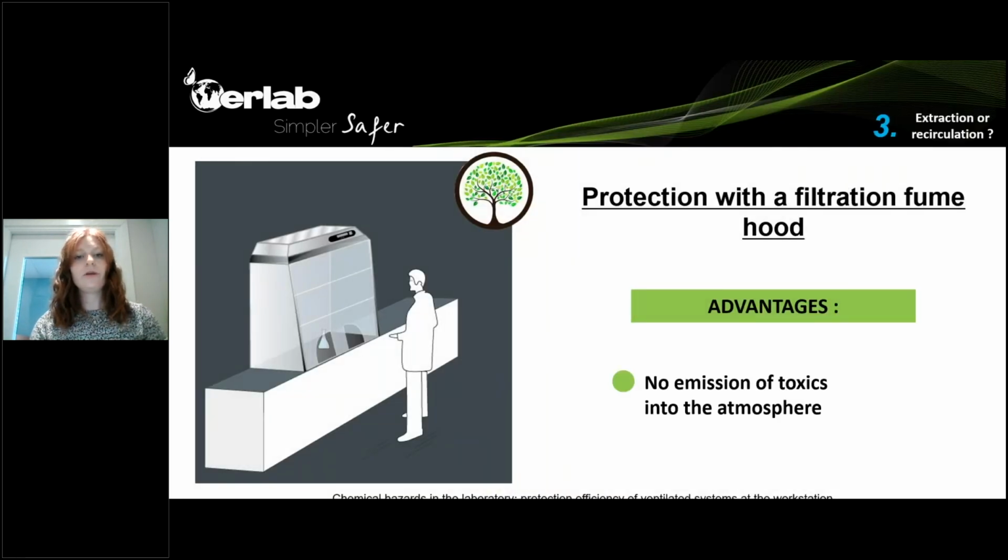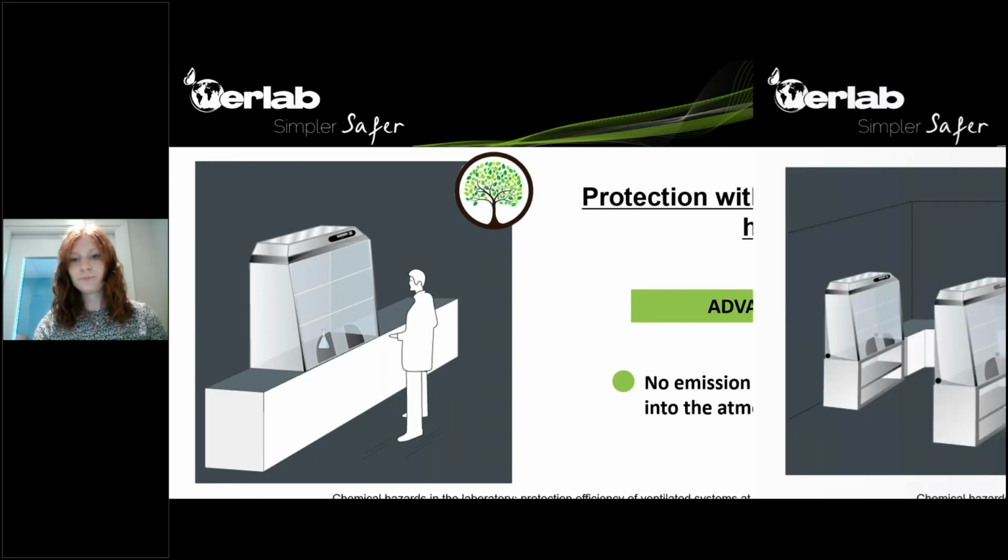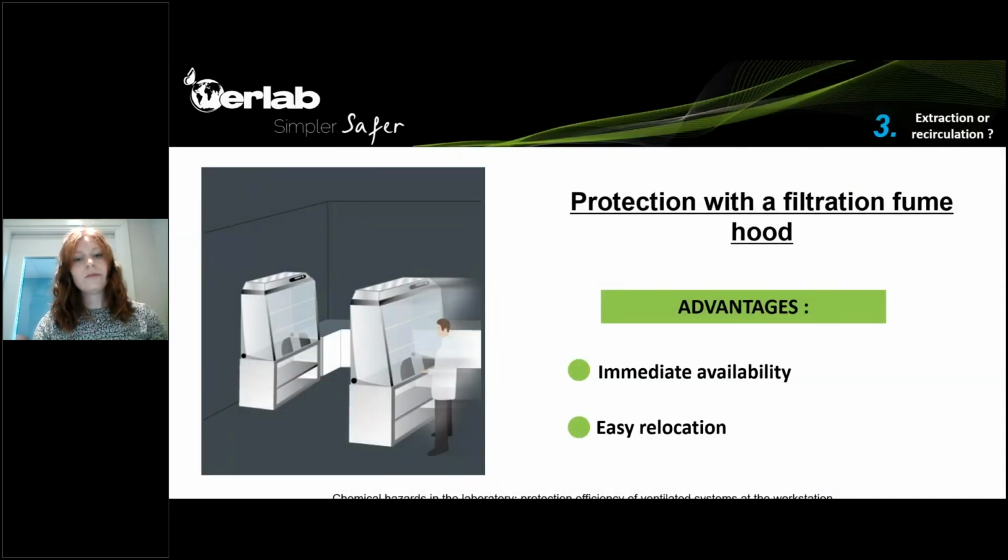The second main advantage is that it is protecting the environment. We know where the toxics are going. They are trapped in the filters. They are not released into the atmosphere. There is also immediate availability of these fume hoods, because there's no need to do any duct work.